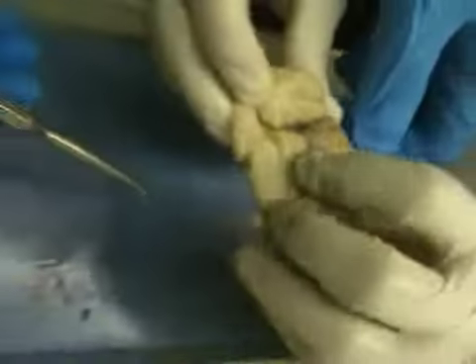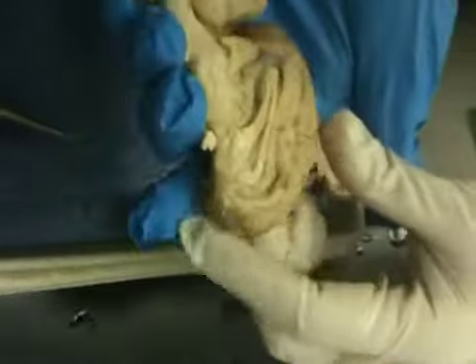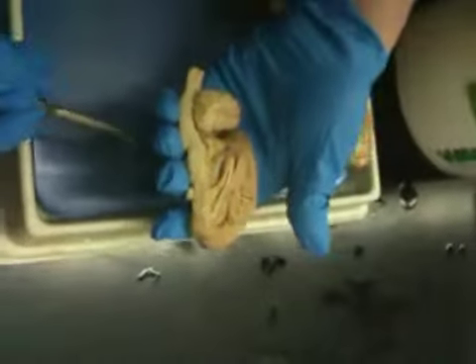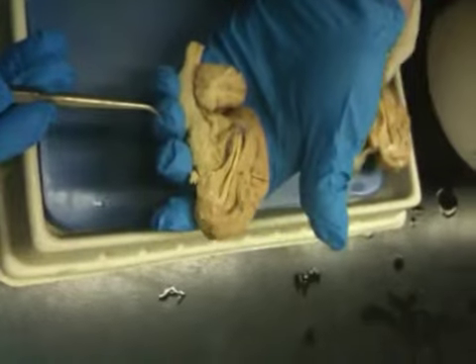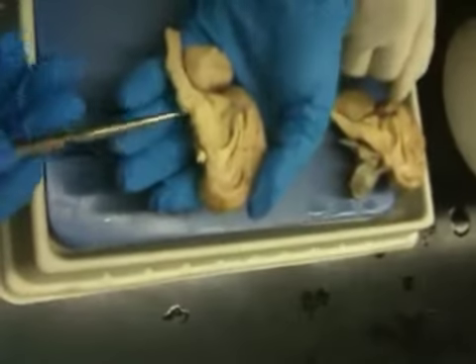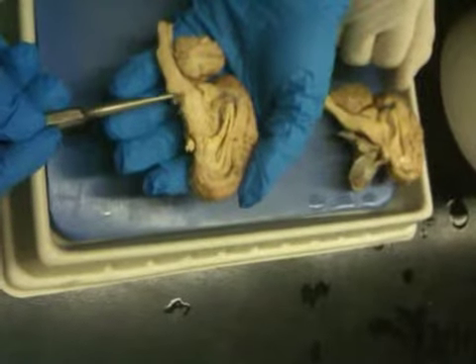Okay, what's the tectum? Both of them together are called the tectum. Individually they're called colliculi. One is rostral, one is caudal. The cerebral peduncle, here's the pons, and the cerebral peduncle should be right here, right above it.